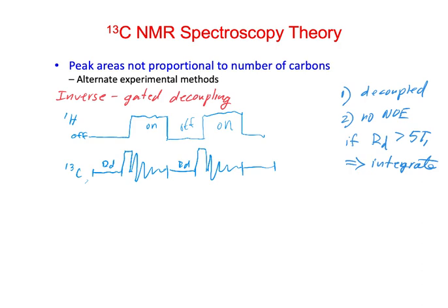But it's not usually practical for us because, for one, we have no NOE, so we're not gaining from signal enhancement, and the relaxation delay is going to be so long that it's going to be really slow and cumbersome for just running down to run a C13 spectrum.